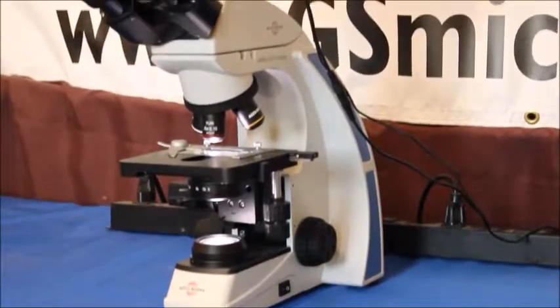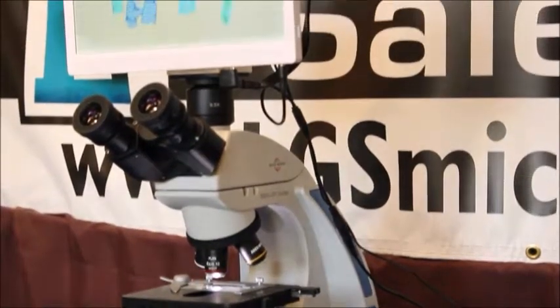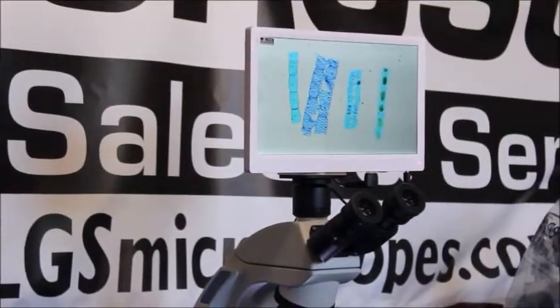There's also another version of this microscope that has a camera attached on top as you can see here. If you're interested in getting a camera to attach to your microscope just contact us and we can certainly help with that.